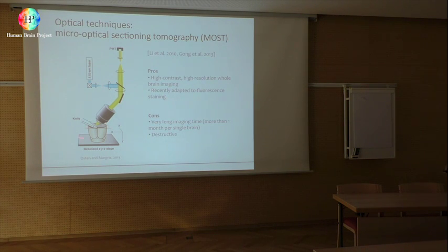They fixed the brain with a very hard resin, okay? And then with a knife, they make a slice, and during the slicing, they make one-photon confocal imaging, and then they realign all the stacks together, okay? And they make the whole tomography in this way.